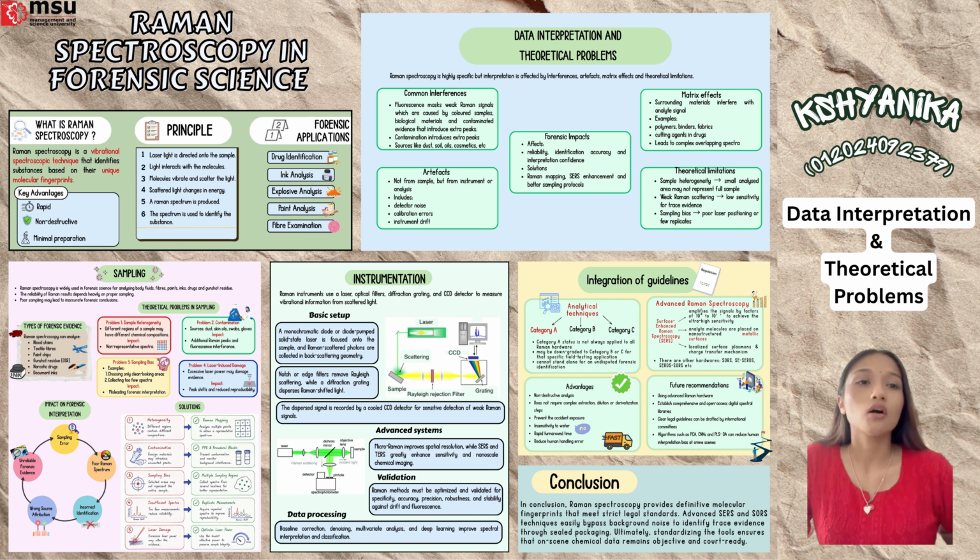There are also theoretical limitations. Raman spectroscopy typically analyzes only a very small area of the sample, meaning that heterogeneous materials such as fibers, layered paints, or fingerprints may not be fully represented by a single measurement.